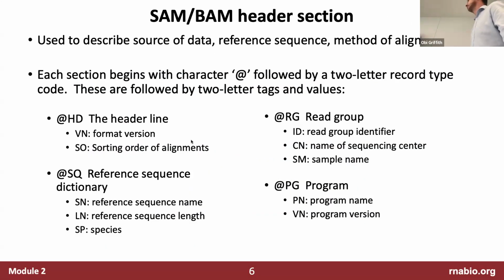So in the header section, it's a good idea to get used to this idea that when you receive sequence data from someone, a fair amount of the time, it could be already aligned data, right? You could have the FASTQ files, but I've already aligned the data, or I'm making the aligned data available. And that in some ways is a great time saver for you, right? I don't have to waste time in compute cycles aligning this data.